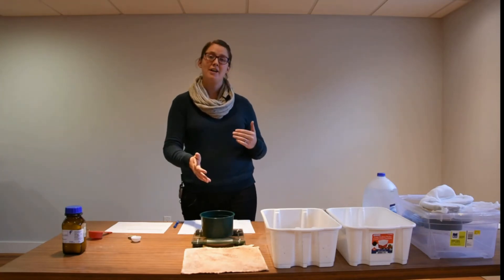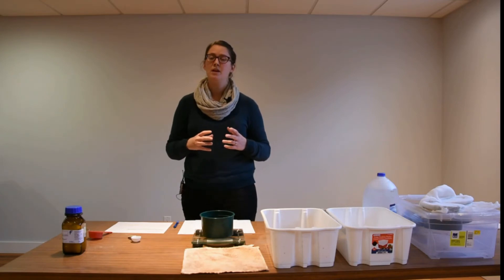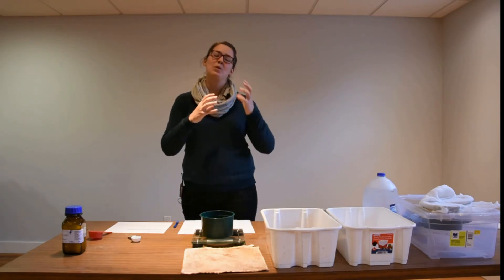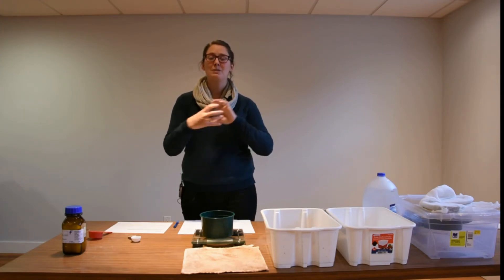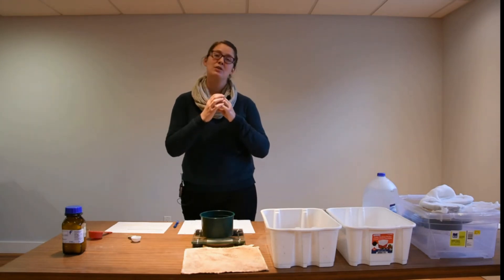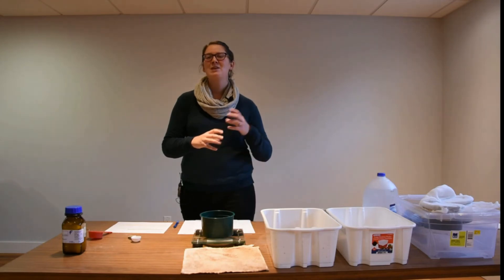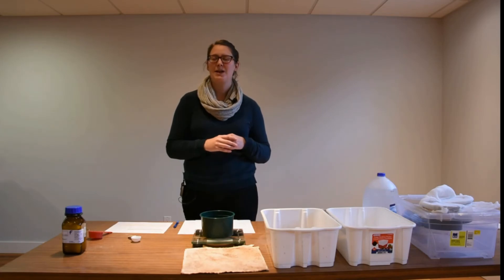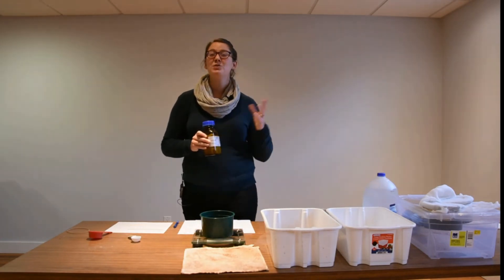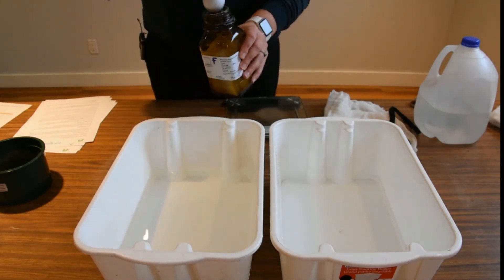Now that we have the weight of our dry water-stable aggregates, we're ready to disperse those aggregates using the sodium hexametaphosphate solution. Aggregates are composed of not only soil mineral matter and clay content, but also organic matter and different chemical compositions holding and binding them together. We're going to use the sodium hexametaphosphate to break those bonds and disperse all the aggregates, so that all that remains in the sieve are particles larger than 0.25 millimeters — including any rocks, gravel, and soil organic matter. To make your solution, grab your sodium hexametaphosphate and an empty bin; you can use tap water for this part. Use two tablespoons of sodium hexametaphosphate for two liters of tap water.